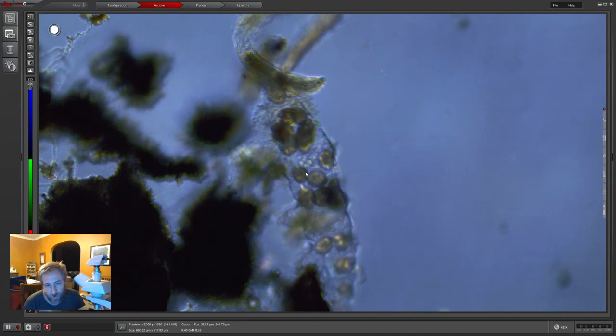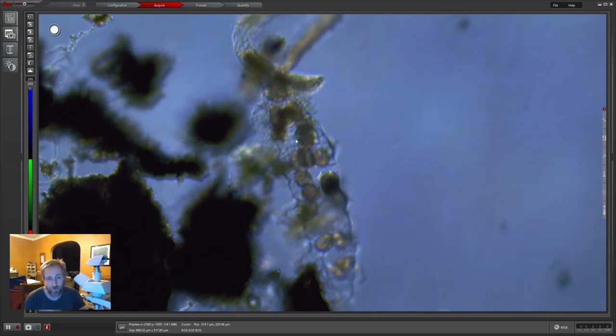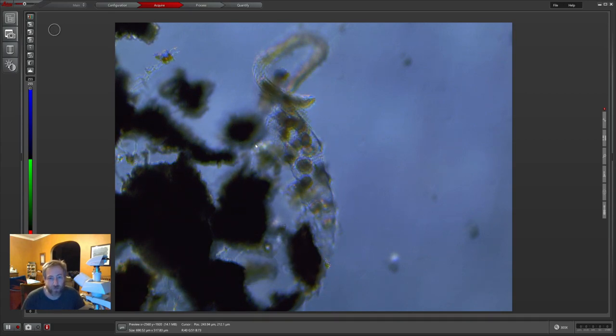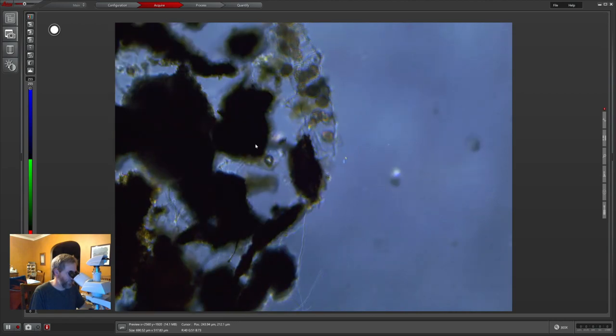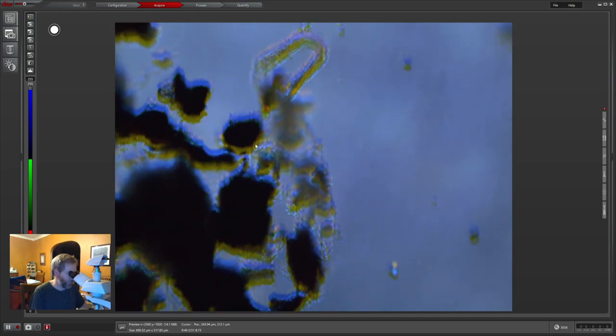I've seen a lot of mites before — especially dead mites in lichen and moss samples is pretty common. But usually it's just a husk; the organism's dead or it's a molt. I think only one time I've ever seen a living mite. And it looked kind of like a water bear, except it only had four legs and didn't have a clear snouty head like a water bear typically has.